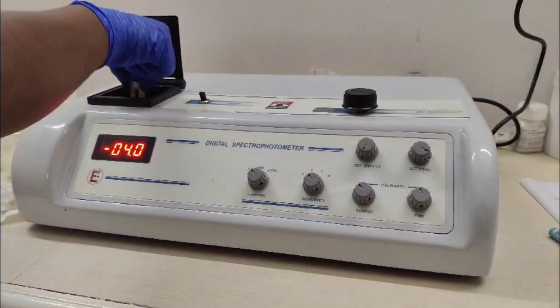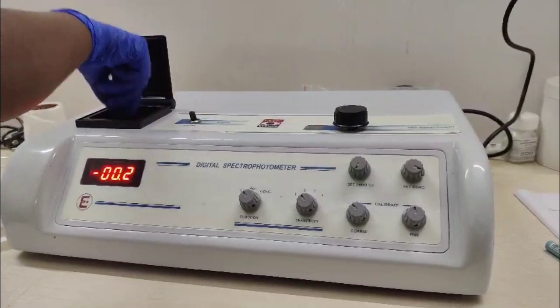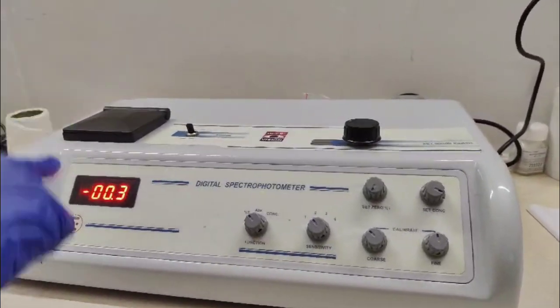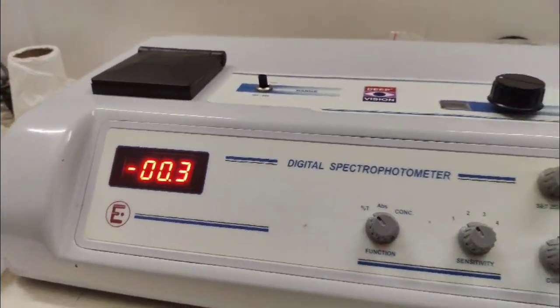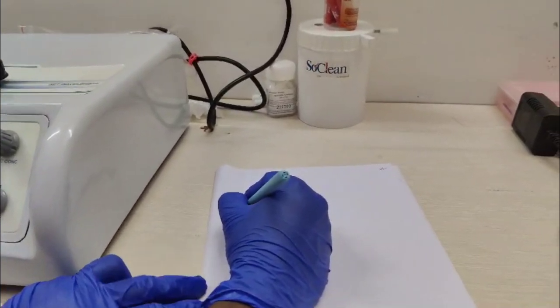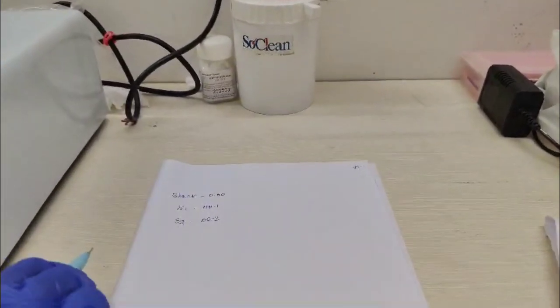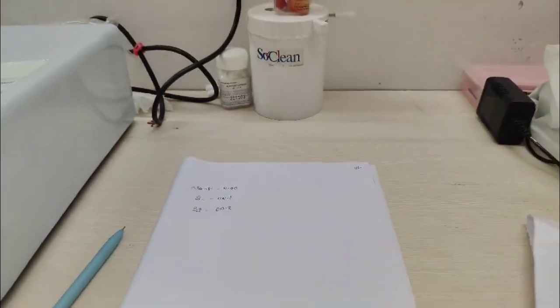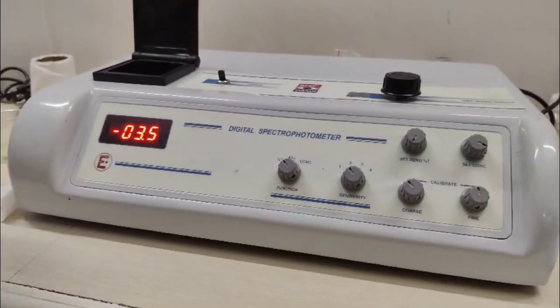Next, fill the cuvette with S2 solution. Value is 0.3. Again, set the blank 00.